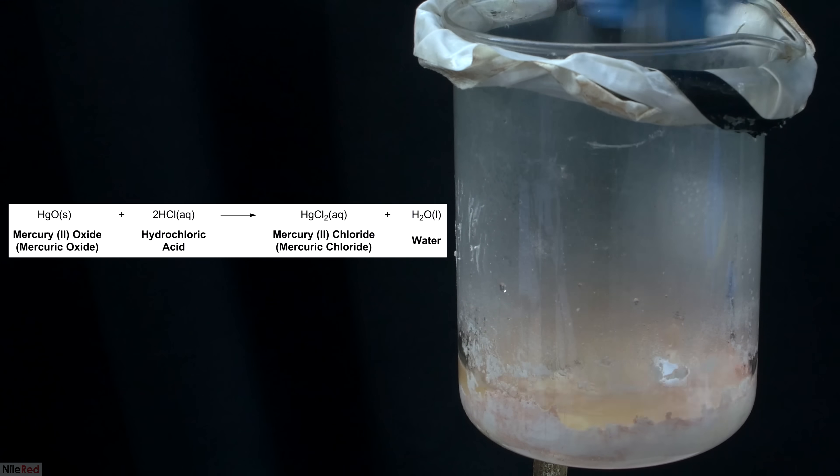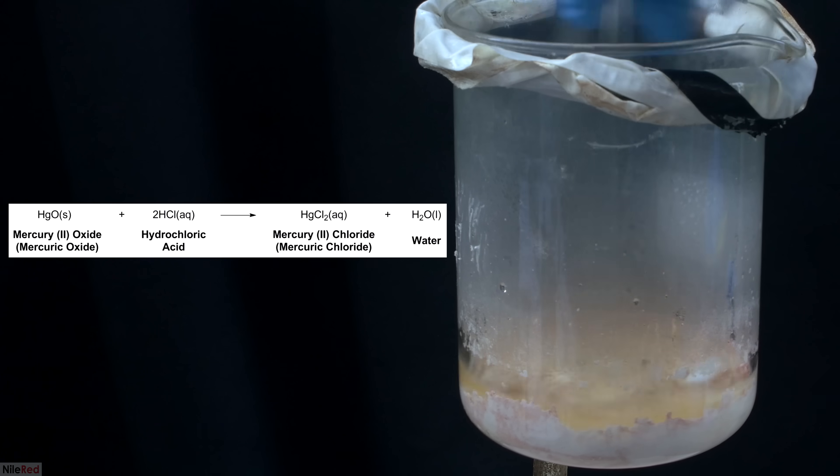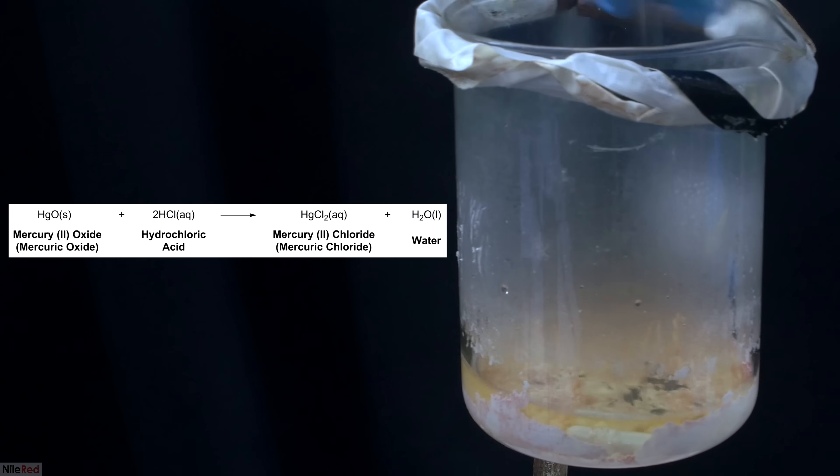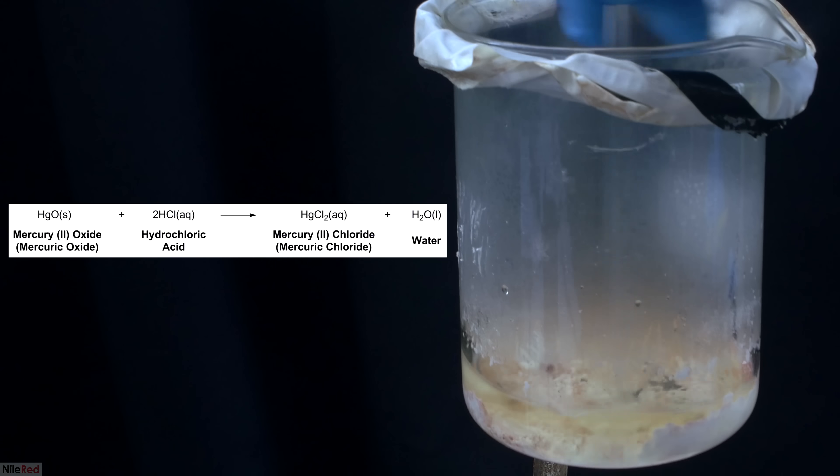After all of the hydrochloric acid is added, I mix things as well as I can using a stir rod, but it's expected that not everything will dissolve. The solution actually takes on a very slight yellow color due to the presence of a little bit of nitrogen dioxide gas.